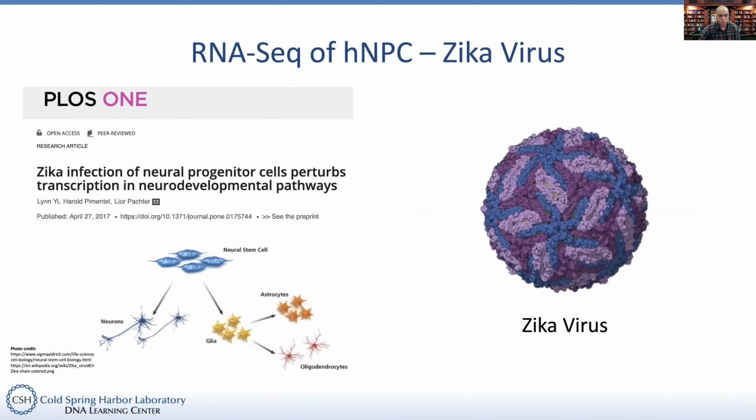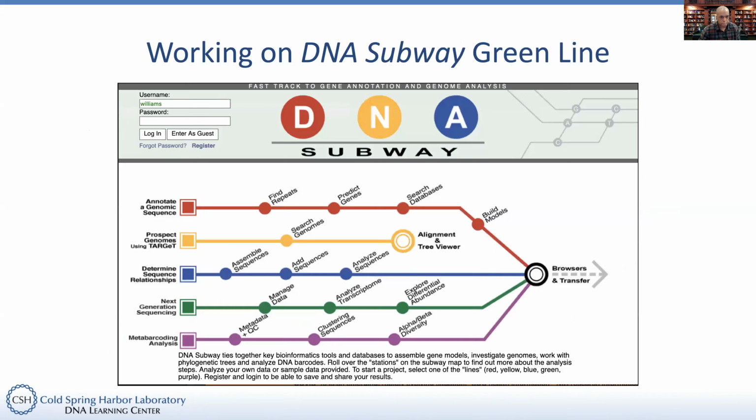Once again, we're working with Zika virus, or rather human neural progenitor stem cells that have been infected with Zika virus. And I explained in the very first video some of the effects of that infection. Obviously it damages those neural stem cells and leads to other significant brain damage.